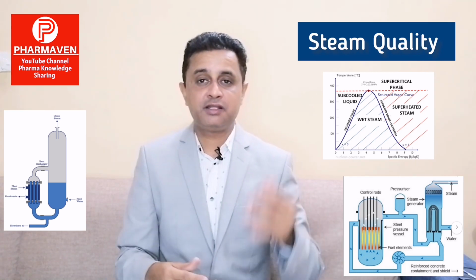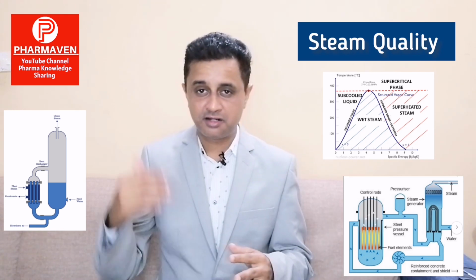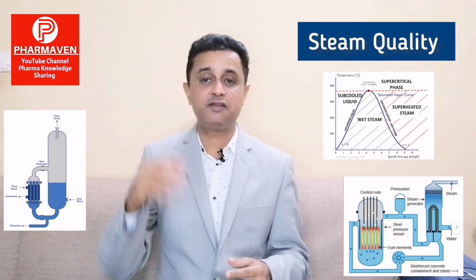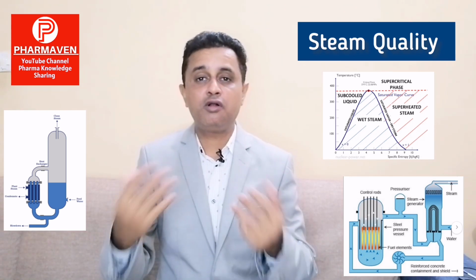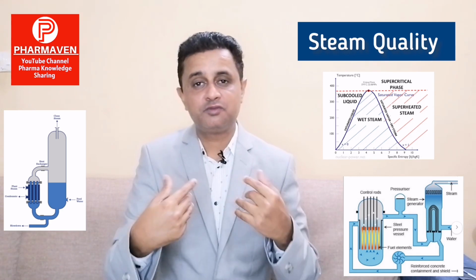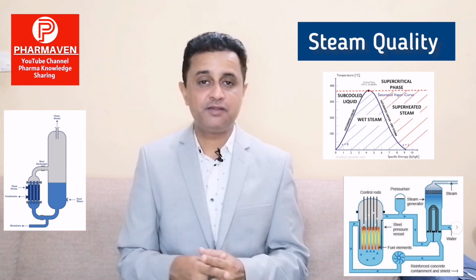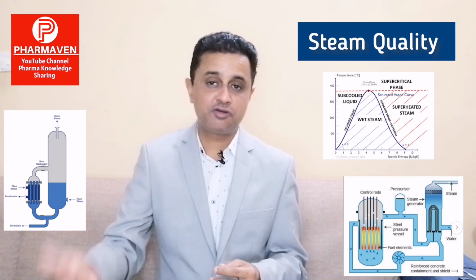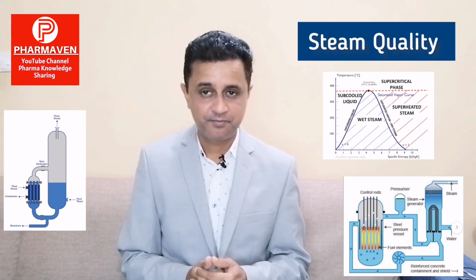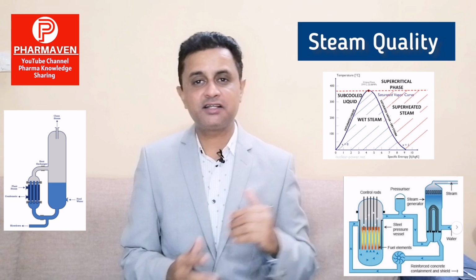One more factor is which cycle is failing: the first cycle of the day, the second, or the third. That also plays a very important role. For example, in the very first cycle, if you have not removed the condensate from the line, it may generate a lot of water initially, and then it is very difficult for the rest of the cycle to remove that water and achieve effective steam penetration. This is also indicated when we check the cycle parameters.